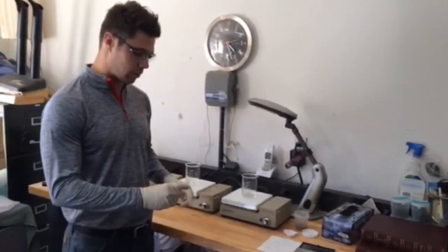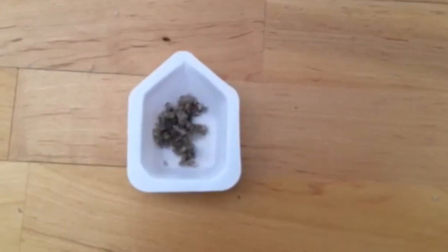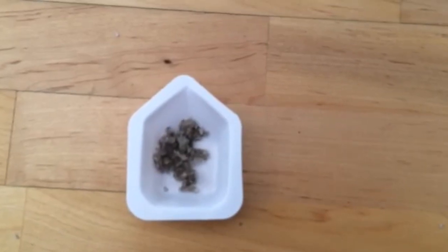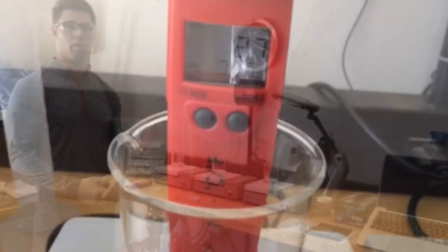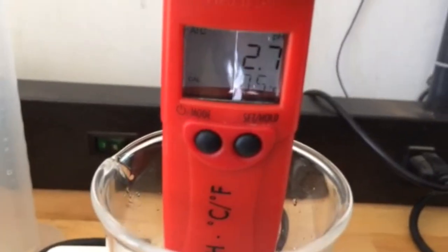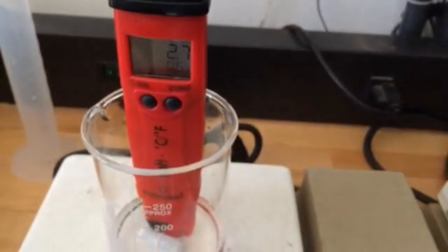We've got three individual samples of struvite weighed out. These are 1 gram samples of struvite, and as you can see, the color is a grayish-white. We've already got a product made up — a 1 to 1, 2 to 1, and 3 to 1 water to product ratio. We are reading the pH of the product and the water made up, which is 2.7.